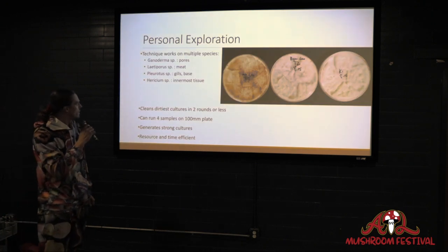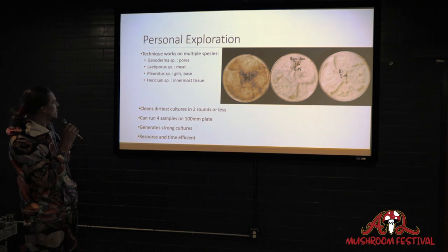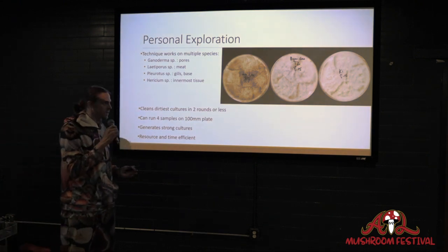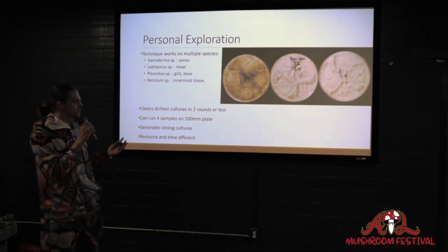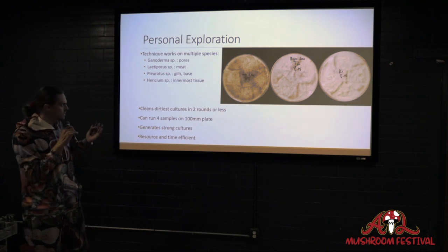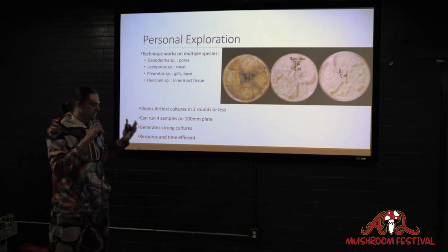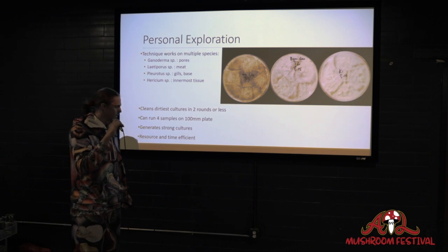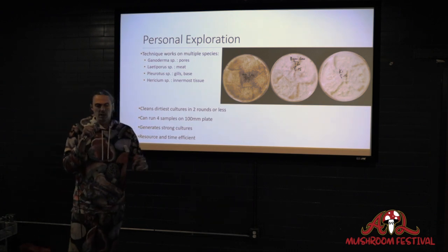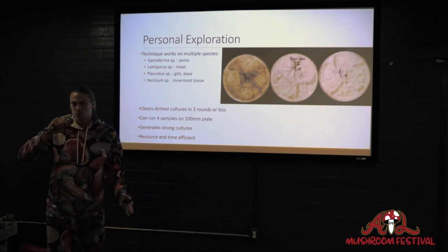And so with me exploring this technique, I found that it works on a whole bunch of different species of mushrooms. I've used it to clean up wild cultures of Ganoderma, your reishi mushrooms, Laetiporus, your chicken of the woods, your Pleurotus, your oyster mushrooms, your Hericium, your lion's manes. And I found that different mushrooms prefer getting isolations from different parts of the mushroom.